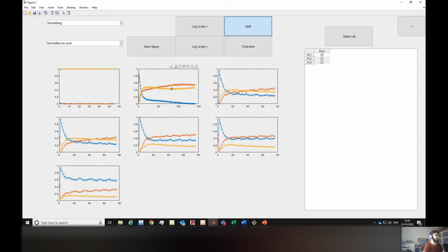So we have 3 colors to describe the chemistry of all your profiles. So it's interconnected, right? If you were to process each of those separately, you know that NMF is not always the same solution, so you will need to check, and you wouldn't be 100% sure that the solutions are consistent. So here, obviously, if I run again, it may be a slightly different solution, but at least for this run, I know it's the same solution for all the profiles.